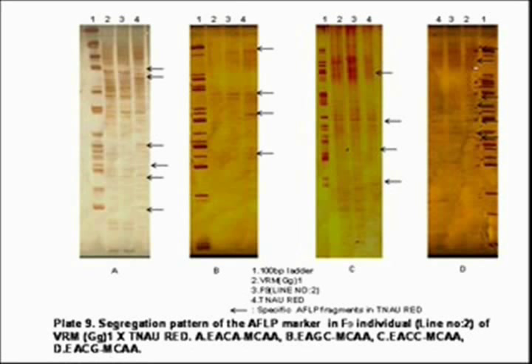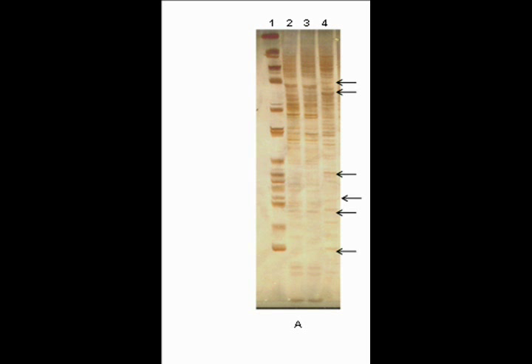This is the AFLP gel photo. Number 1 represents the 100 base pair ladder. Number 2 and number 4 are the parents, that is VRM and TNAU Red. Number 3 represents the F9 population. Using AFLP, we are finding to which parent the F9 population resembles. The arrow mark represents the band which is present in TNAU Red, lane number 4, but not in the F9 population, lane number 3. The F9 population resembles VRM, lane number 2, since the bands match each other.